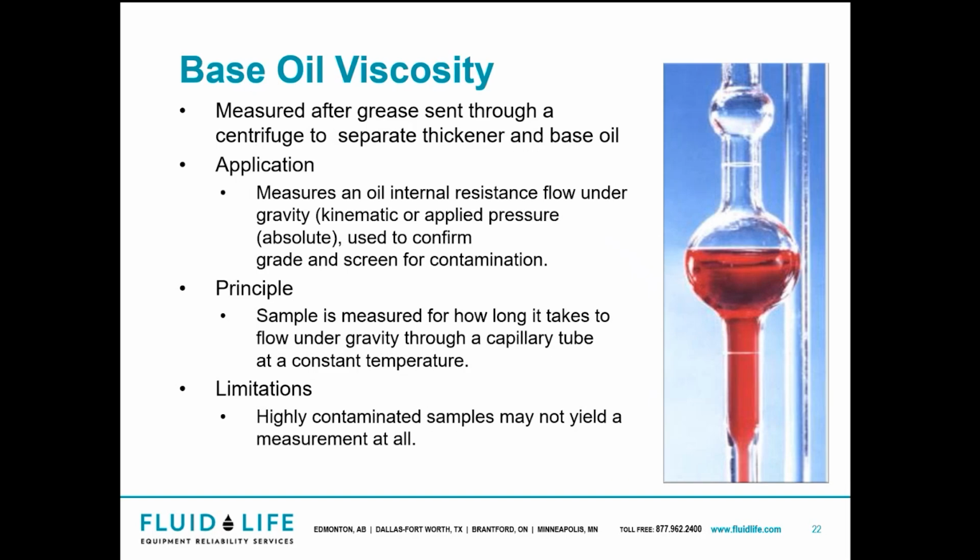When it comes to viscosity, this is measured after the grease is sent through the centrifuge to separate the thickener and the base oil. So you're not sending grease through a viscometer. And then what we do is we just take that oil, like we would do for any other one of your oil samples, to grab the viscosity.